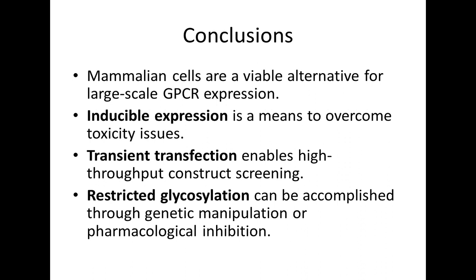We didn't really get into it today, but purification of GPCRs usually is sort of an art field unto itself. Once you do get up to high expression levels, there's a lot of work that's been done regarding different detergents that can be used to help preserve functionality and that kind of thing. But that's kind of a different topic for a different day.